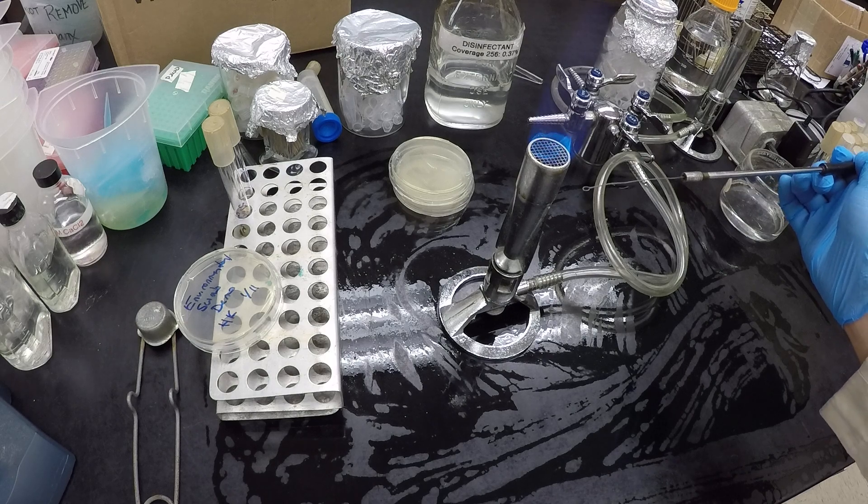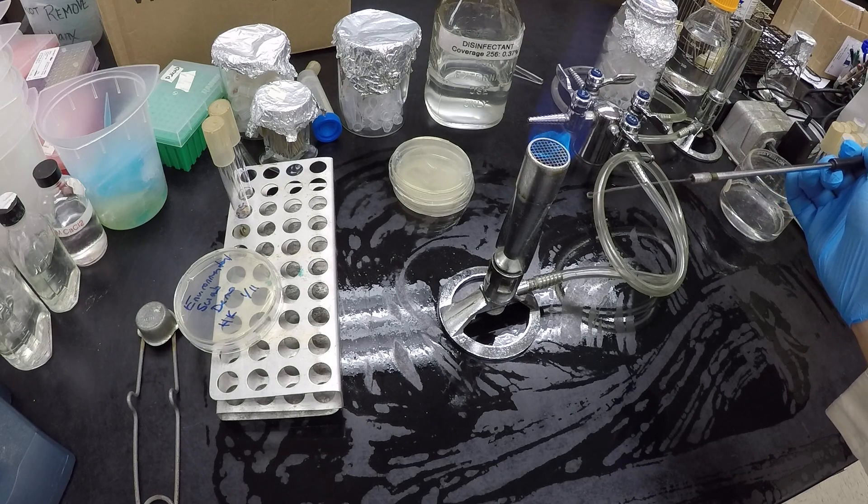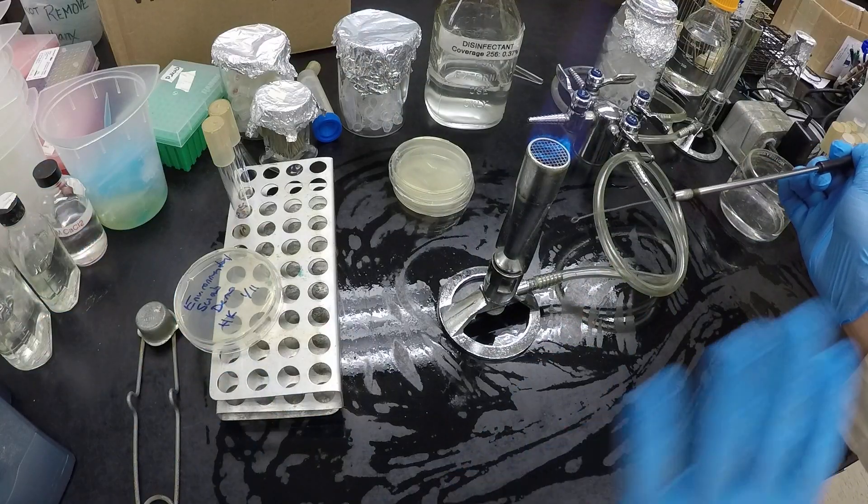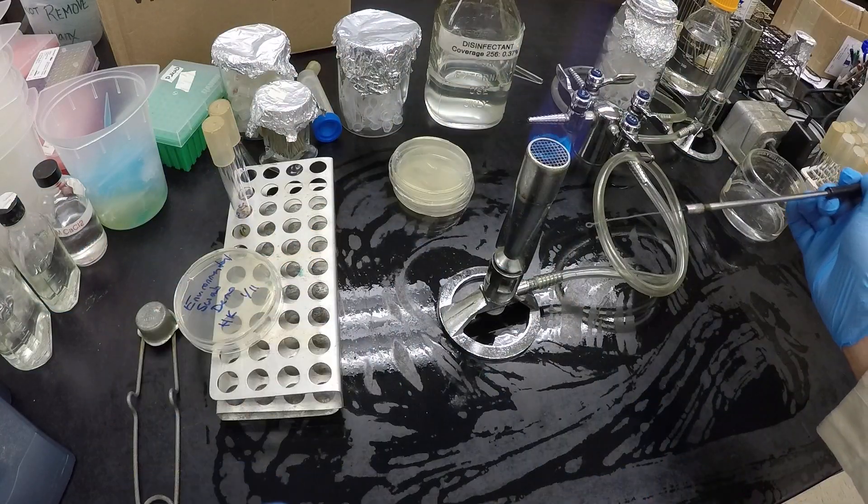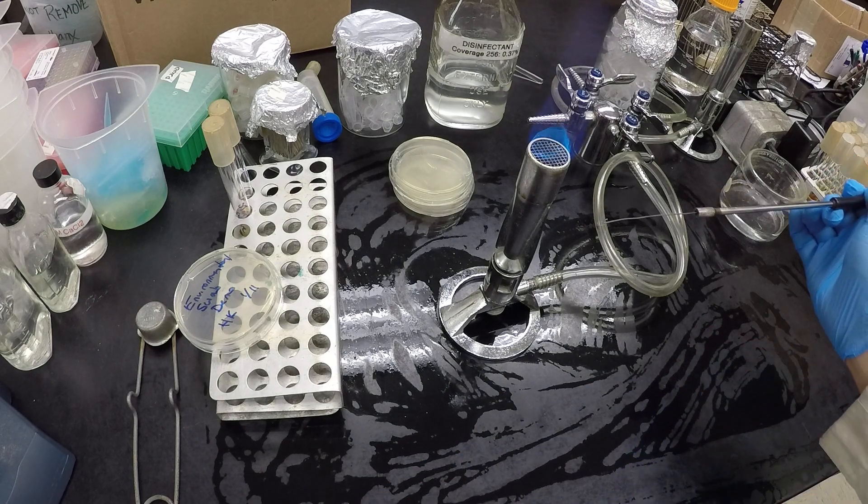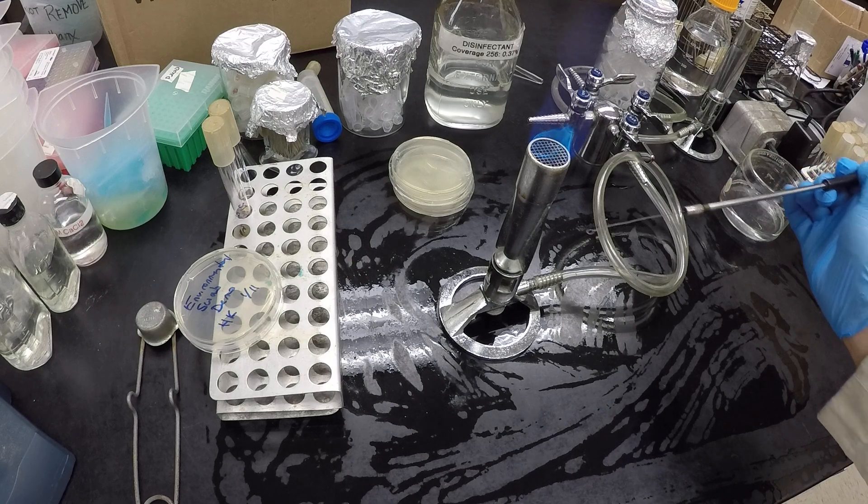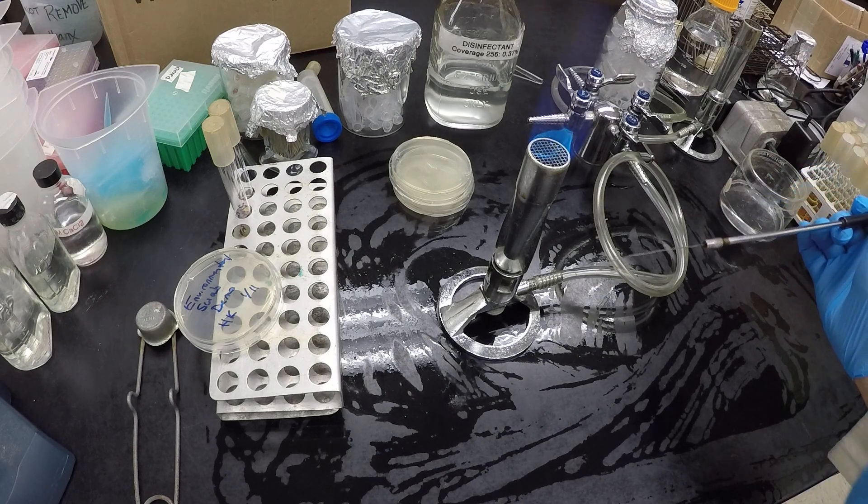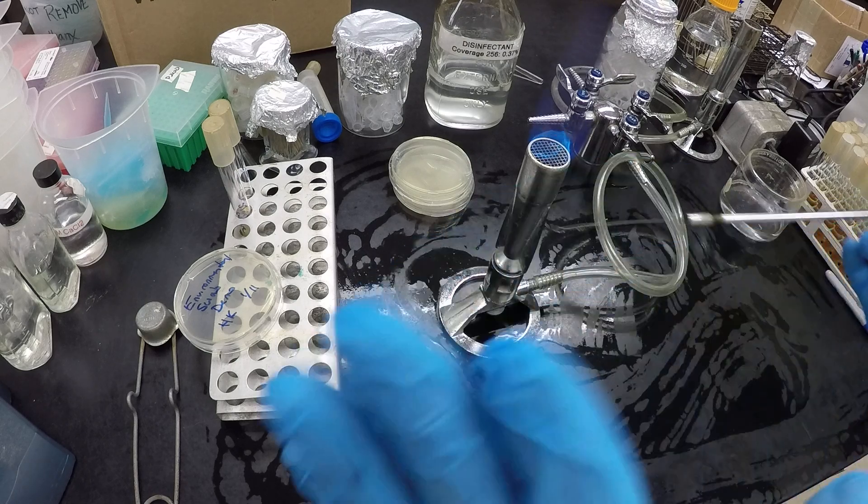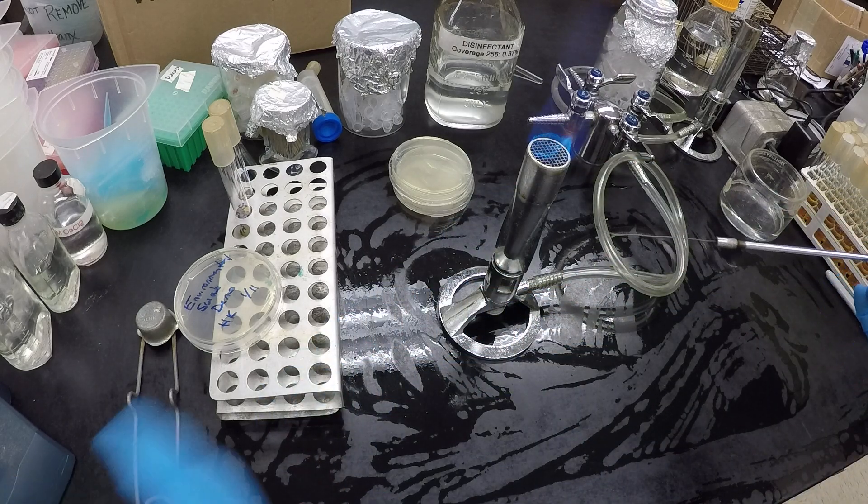Okay, so this brings me to the third source, or I lost count now, fourth source of contamination. That's the air that's around us. And there's stuff floating around all the time, especially in a room such as this where there's air conditioning, and then the air-conditioned currents will keep, especially mold spores, floating.